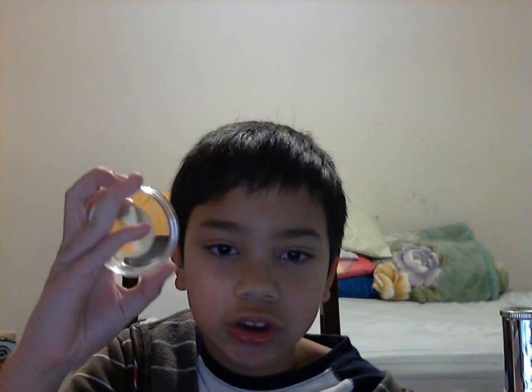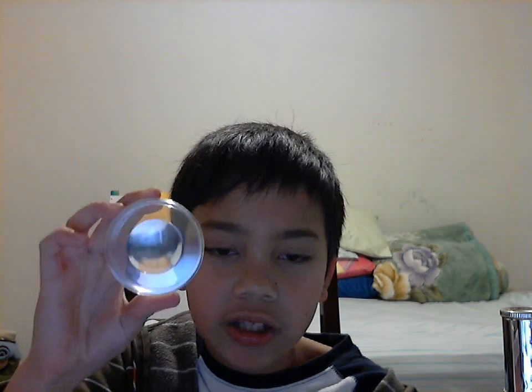It's just cool. And it has a magnifying glass. There's a Petri dish — when you put something inside, that's bigger, that's big. There's a magnifying glass to see that, to see it more nicely.